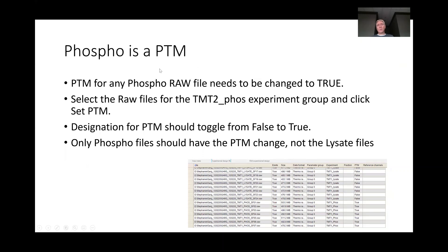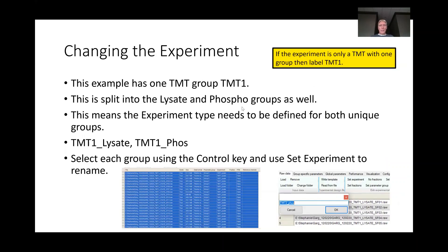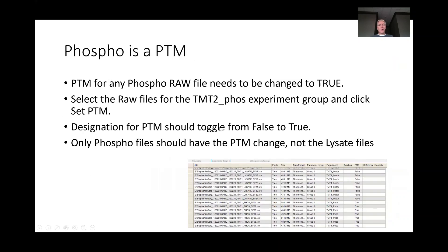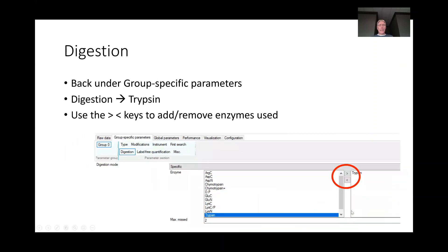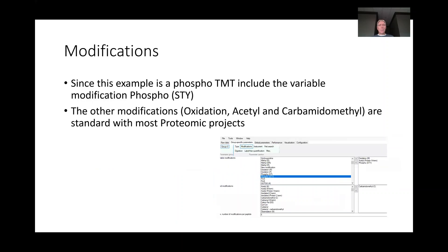For the phospho experiment, we'll have two datasets: superfractions for my lysate and superfractions for my phospho. The phosphos are all PTMs, so I want to make sure that's clicked over here in this particular column. Then I want to make sure that I have the correct digestion—trypsin digestion is pretty common—and then modifications. Because we're going to be doing a phospho in this example, I will also include that in the variable modification.